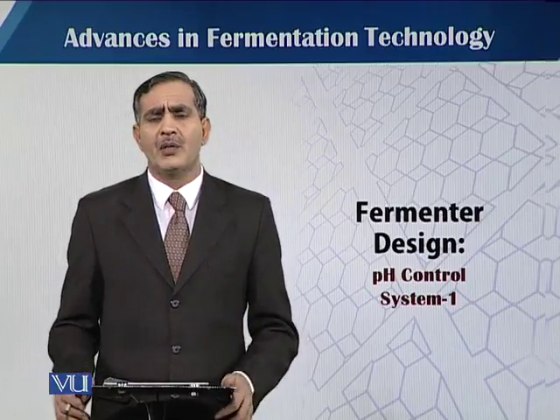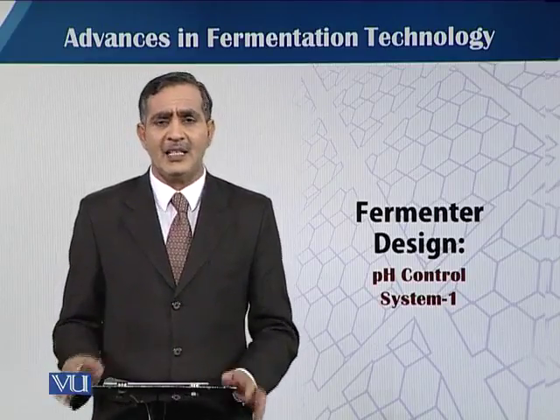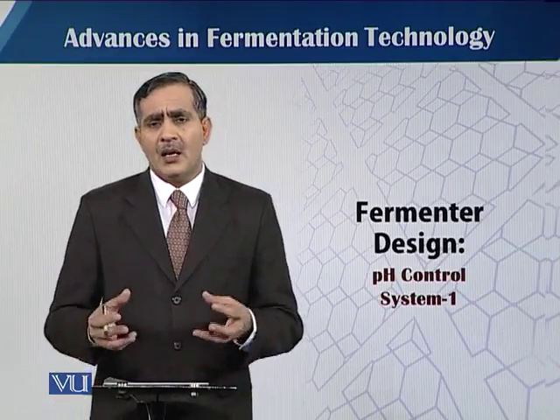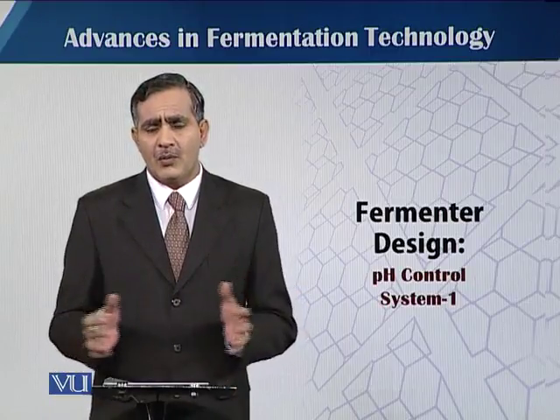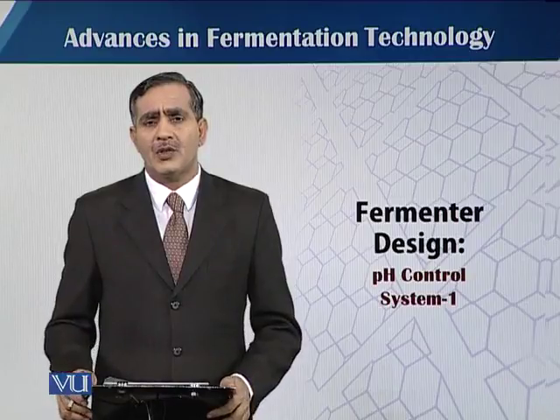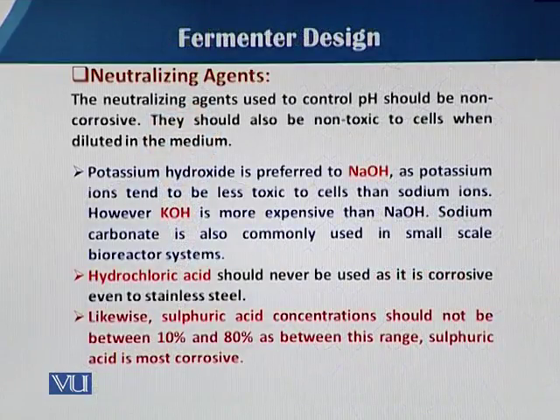Normally, when we want to control the pH, we have to use either an alkali agent or an acid agent. So the whole system should be controlled with alkali and acid. pH is very critical.